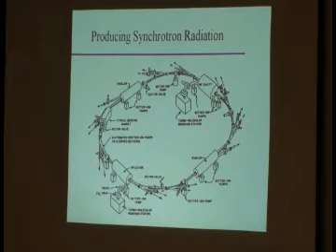So every time you bend that electron path, you get X-ray radiation out. That is how a synchrotron works. Which means at each bending magnet, you get X-rays. You can do experiments. And these wigglers really do nothing but wiggle the electron beam path, which means the electrons once again are accelerated and you make more X-rays. There will be a handout further on where we will actually talk in more detail about what that is like, what that means, how that works.